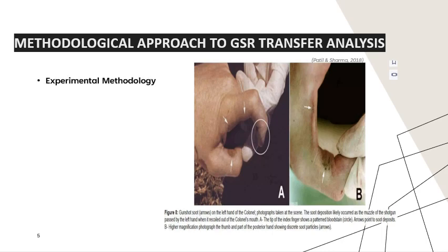So there's your experimental methodology, choice of firearm and ammunition. For this study, the experiment was conducted using a Sig Sauer P226, which is different from other weapons in how they distribute their gunshot residue. This one is a commonly used 9mm self-loading pistol, ensuring the study's relevance to real-world forensic cases as being a common weapon that is used.